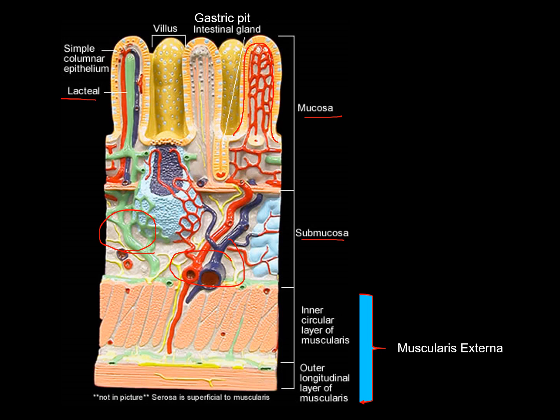So the fat goes into the lymphatic system in the small intestine, which is how we digest fat. So even though our sugar and protein goes into the portal circulation in the liver, the fat goes into the lymphatic system first. And then you can see these layers of smooth muscle in that muscularis externa. So these guys are kind of coming in at you, kind of a circular layer, and these are the longitudinal layer that are kind of lengthwise. And then of course it says the serosa is not in the picture, but that would be that outermost connective tissue layer.